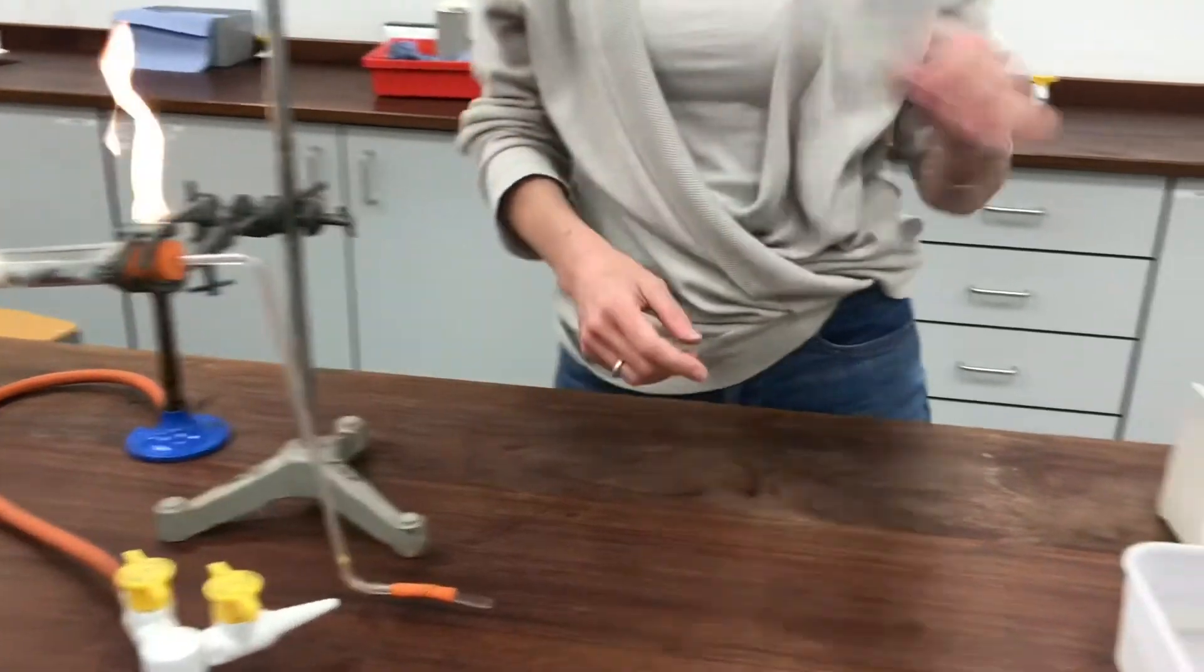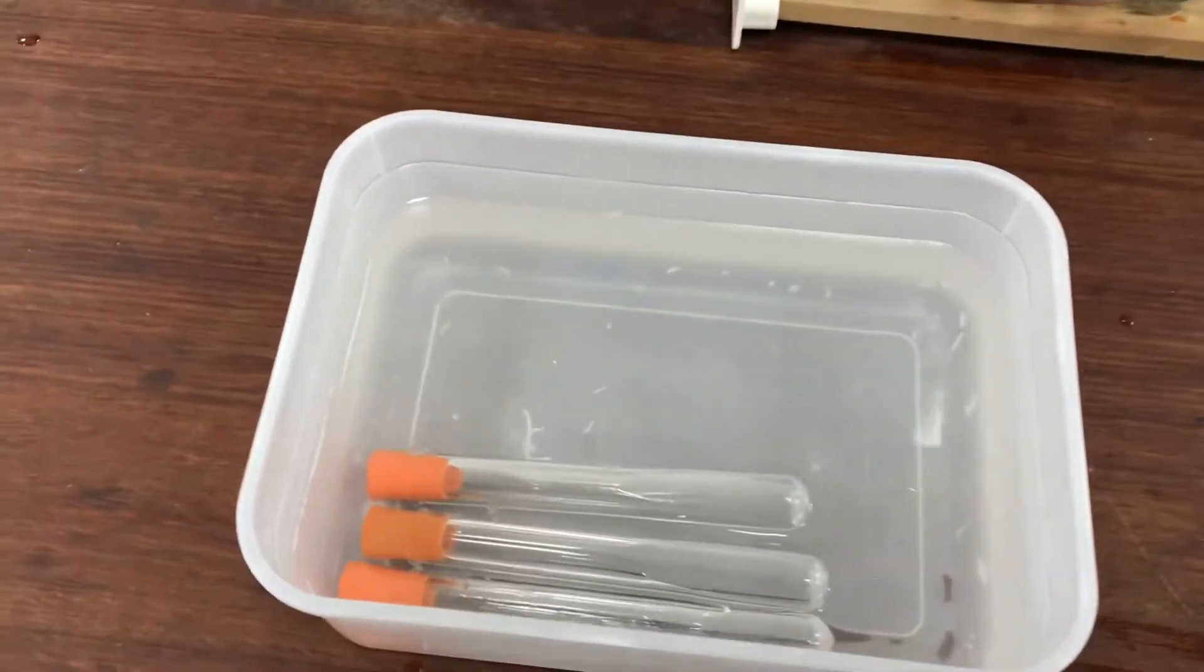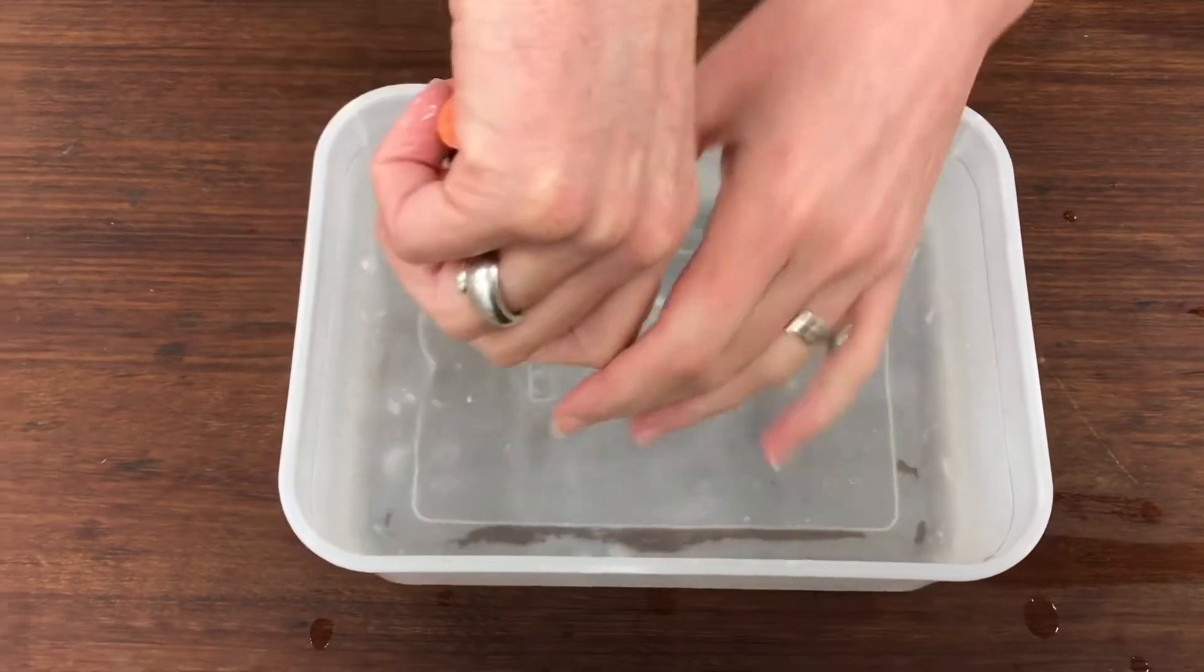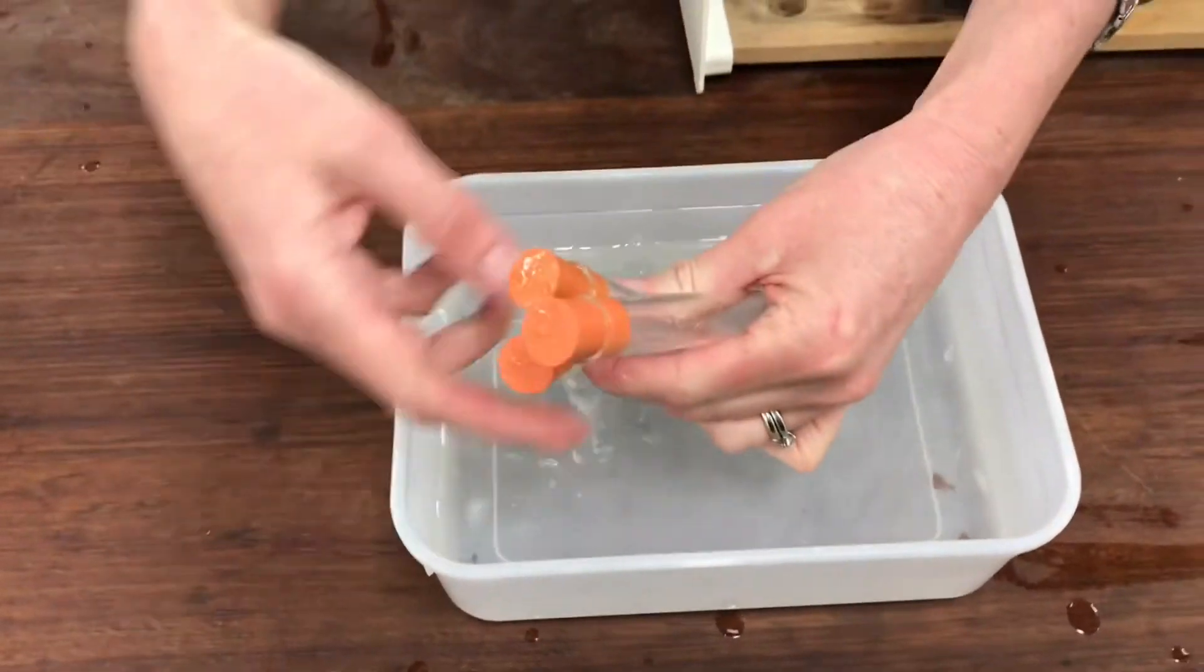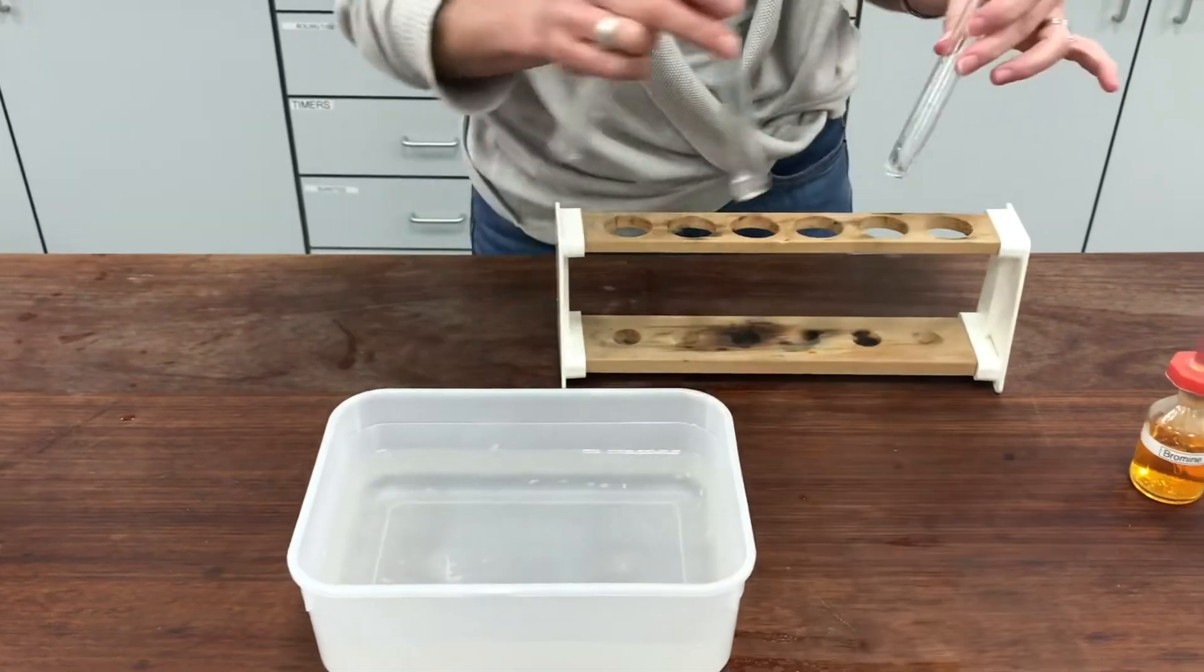OK, if we have a look now in the water bath. You can see there's some oily residue over the surface of the water bath which doesn't look very nice. But I've also managed to collect three tubes of gas here. So what I'm going to do is to test those using some bromine water.